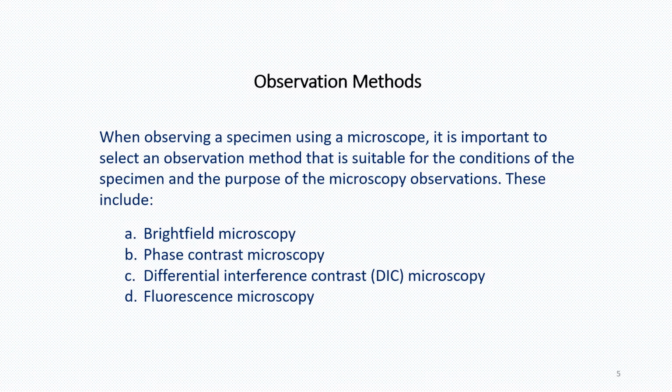Let's talk about some of the more common microscopy methods that you could use to observe your specimens. These include contrast-enhancing techniques that generate intensity changes which are useful for microscopic observation and imaging.